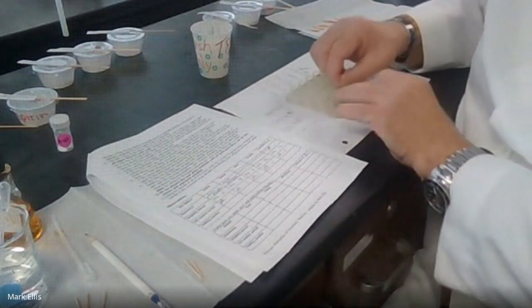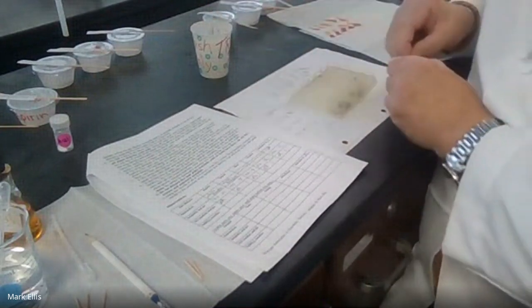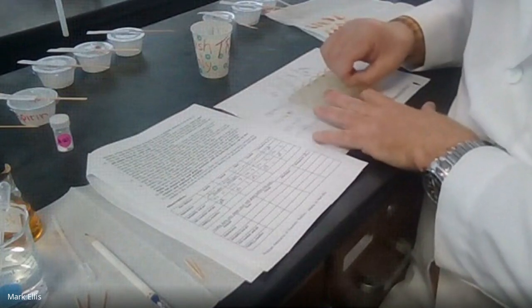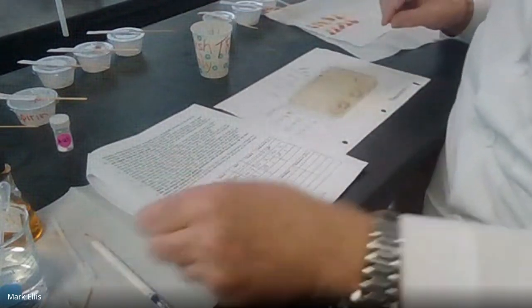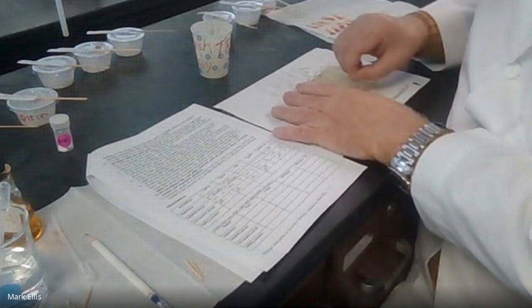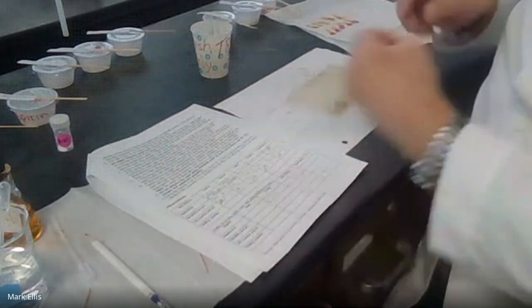So the first one with the aspirin just turned a slight pink. For the second one, for the Tylenol, it turned a dark blue. For the Advil, not much of a change. It kind of turned yellow. For the Excedrin, it turned purpley, kind of even a darker blue than the Tylenol. And then for my unknown.